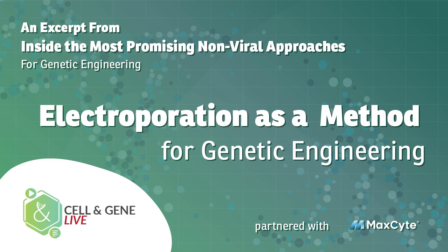We're going to talk a little bit about electroporation. It's a common non-viral method for NK cell engineering. And so, Bob, while I still have you, how does Celularity view electroporation as a method for genetic modification of placental-derived cell therapies?